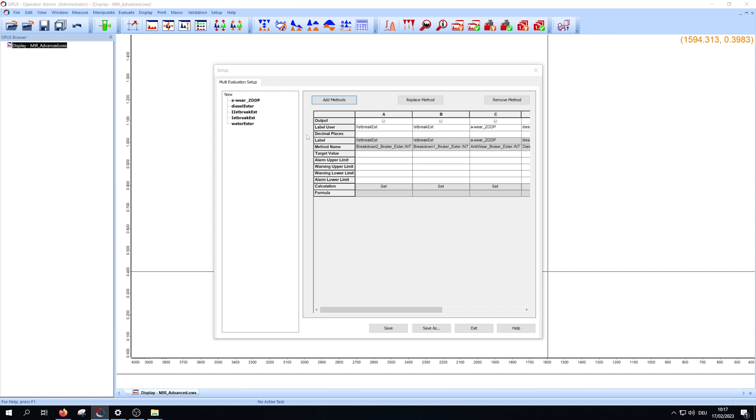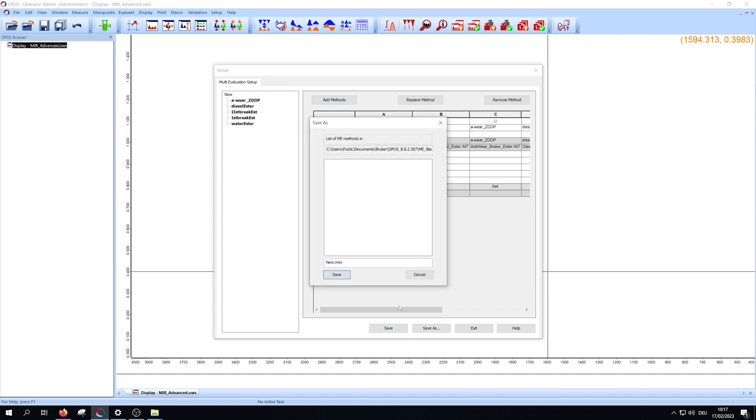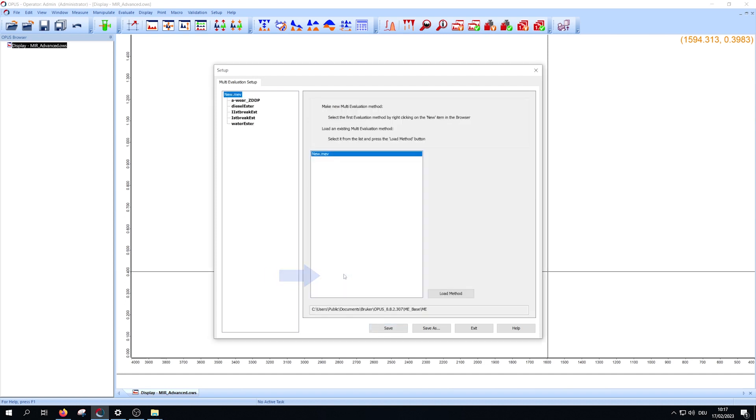In the last step, save your multi-evaluation method via save or save as. Afterwards close the window with exit.